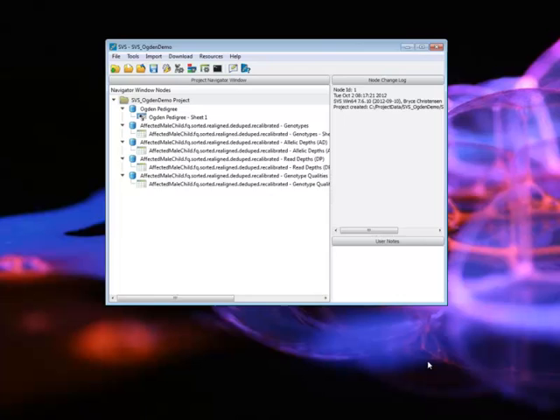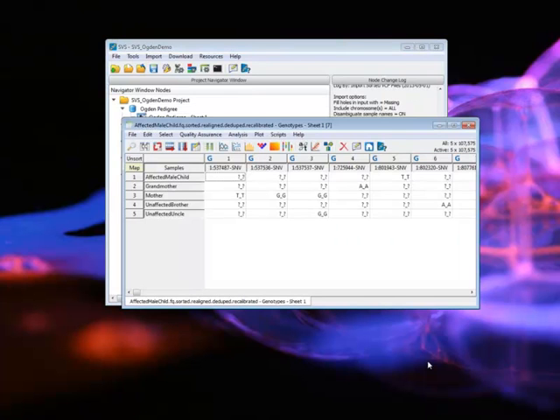It can be single sample, multi-sample. As long as it adheres to either version 4 or 4.1 conventions for VCF, we can handle it. Any number of additional annotation fields, it's not a problem. We've spent a lot of time building a tool flexible enough to read any VCF.